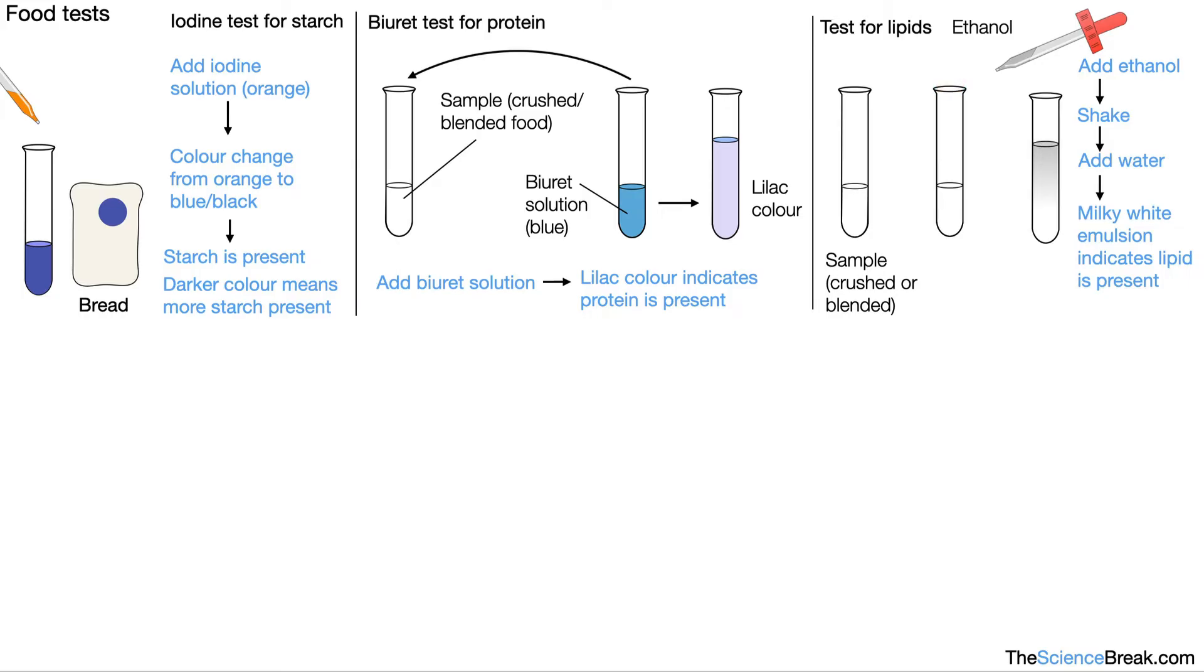We then add water, and if we see a milky white emulsion, this indicates the presence of a lipid. So here's our solution. This is supposed to be a milky white emulsion. It's gray there, but please remember it has to be a milky white emulsion to indicate the presence of lipid.